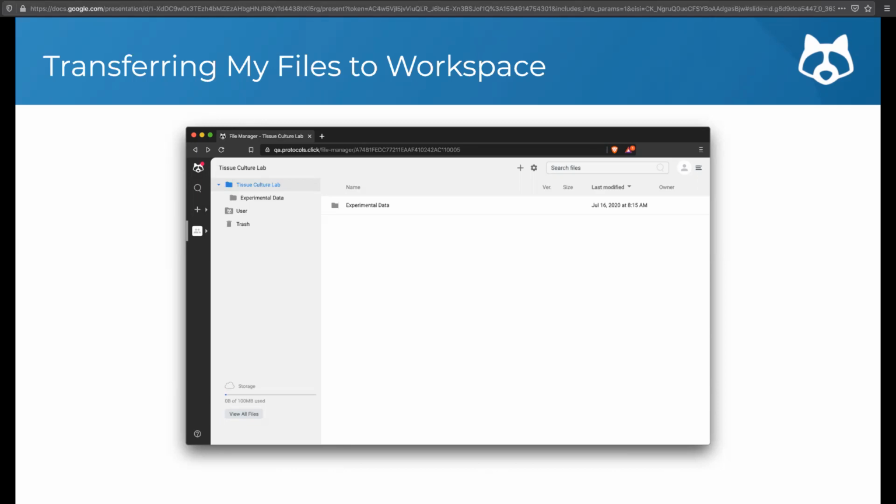Great. And then there's another question. What changes if you upgrade your workspace to premium? Yeah, so we are rolling out some exciting changes to the premium model, and more elements of that will be announced in the future. But with the Workspaces changes, what you'll be able to do is have removed limits on the number of private protocols that you have. You'll have an increased amount of storage, and you'll have overall more control on everything that you're doing with the platform on a private side of things.